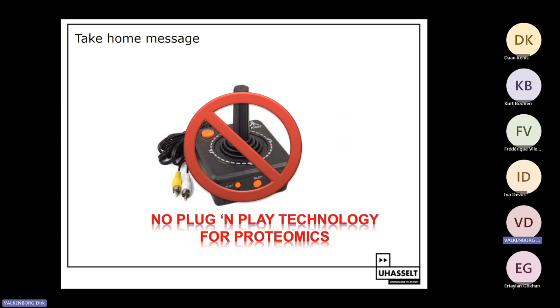What I've explained now are the methods used a decade ago. Now with the rise of AI technologies, especially generative AI, there is a new generation of algorithms that make use of better models that predict the theoretical spectra.